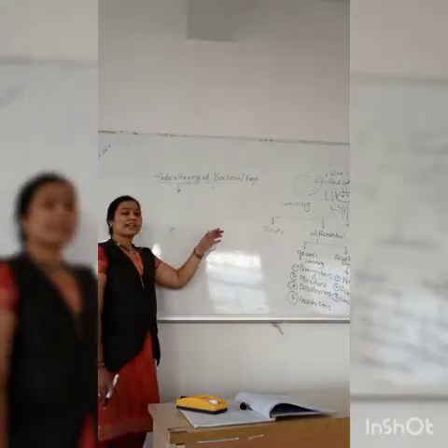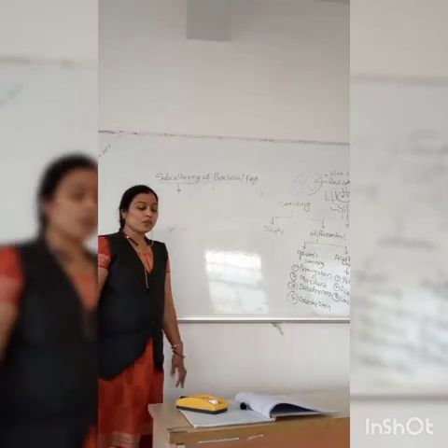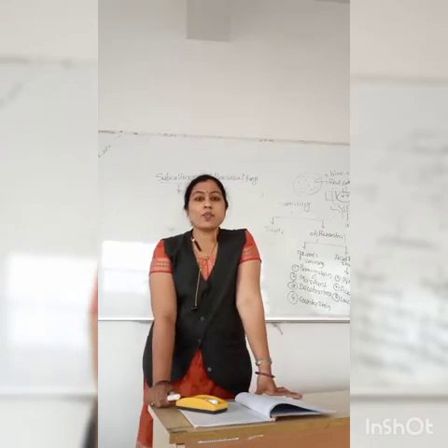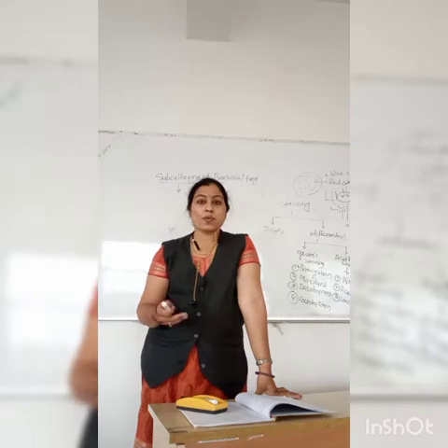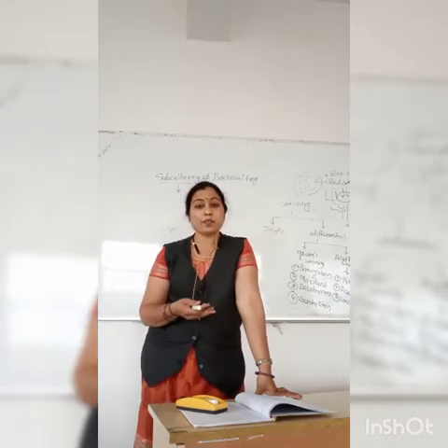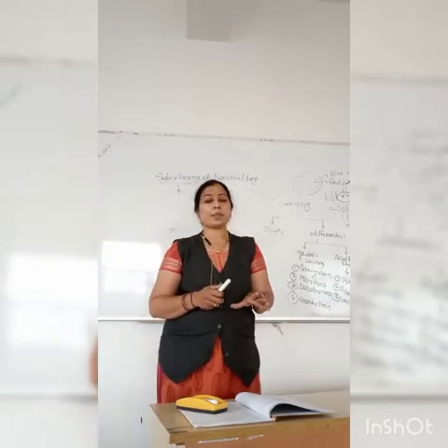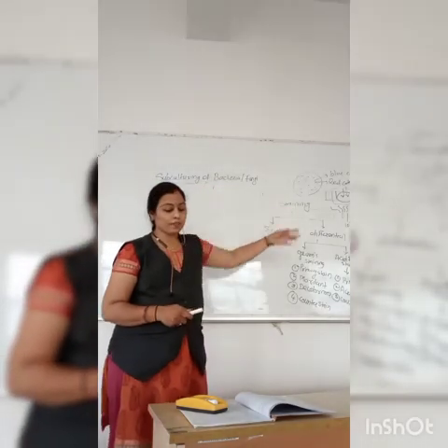So our next practical is subculturing of bacteria and fungi. So what is subculturing? Subculturing is an aseptic technique by which we can transfer the fully grown organism, which is already grown on solid or any type of media, into freshly prepared media. That is the subculturing method. So we have to subculture the bacteria and fungi.